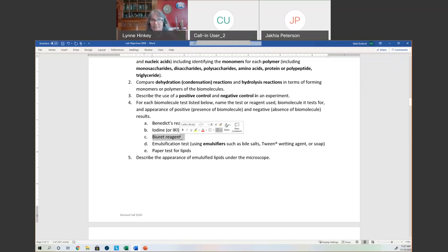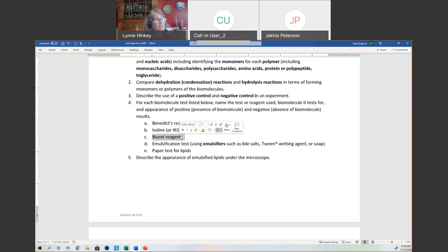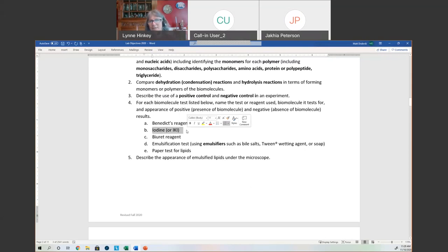Biuret reagent tests for proteins. Proteins are made of amino acids linked together with peptide bonds, and what causes the color change are those peptide bonds. If I have lots and lots of peptide bonds, like with a big protein molecule, I'm going to get a purple color. If I have smaller peptide chains, it's going to be a little paler — maybe pinkish. Either one of those indicates peptide bonds. If I have no peptide bonds, it will remain blue. Even though Biuret turns purple, it's sort of a transparent light purple. Iodine is a very dark purple-black. That's the distinction — Biuret is translucent, light can shine through it; with iodine it's going to be very dark, almost black. So if you see a picture, those should be very distinct and different.